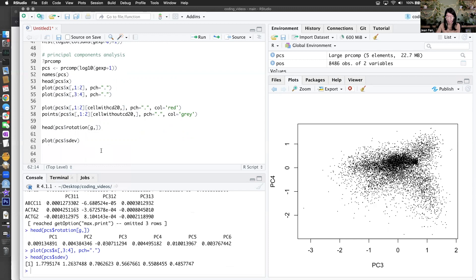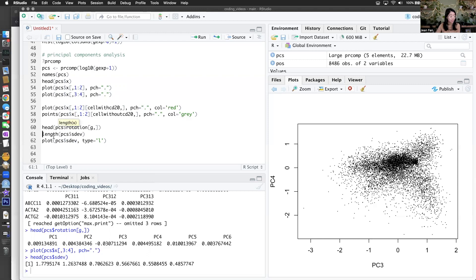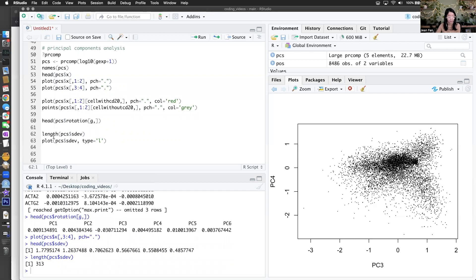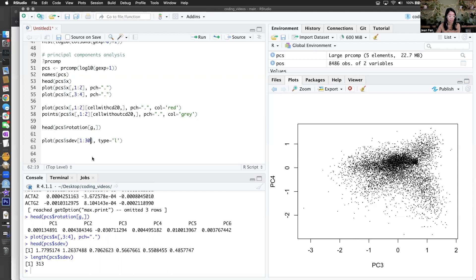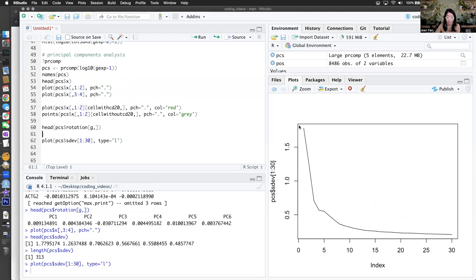No point in looking at numbers if we can visualize them — I'm going to visualize them as a line. How many PCs did I compute? Just as many as I have genes, so I don't want to visualize all of those. Let's visualize 30. The amount of variance being explained drops pretty dramatically — maybe I'll only need really 10 PCs to capture all the variation.